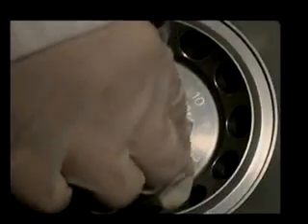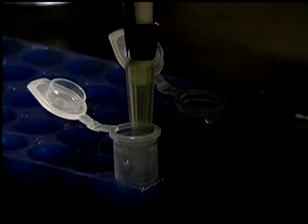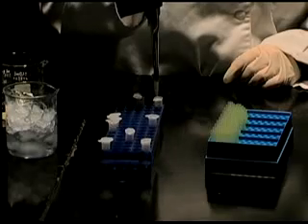Place the tube in a microcentrifuge and run it at full speed for 5 minutes to facilitate the precipitation of unwanted fragments. When it's done, a pellet of unwanted fragments should have formed at the bottom of the tube. Pipette 0.5 milliliters of the supernatant into a fresh tube. This will contain plasmid DNA.